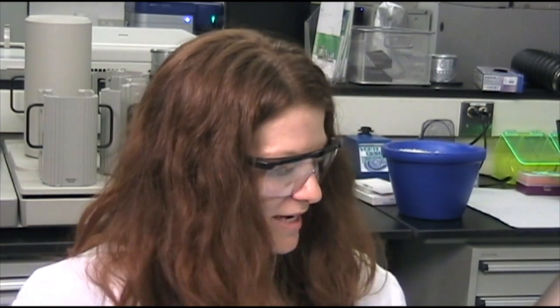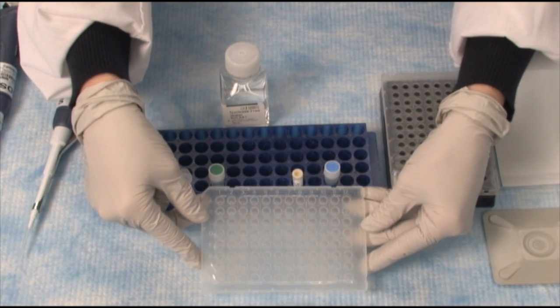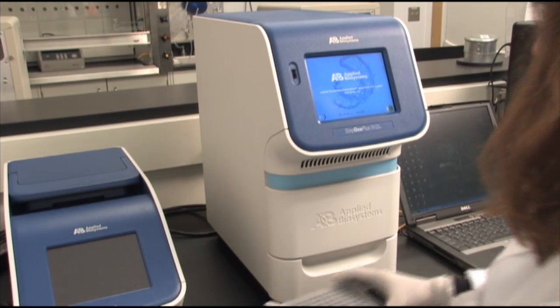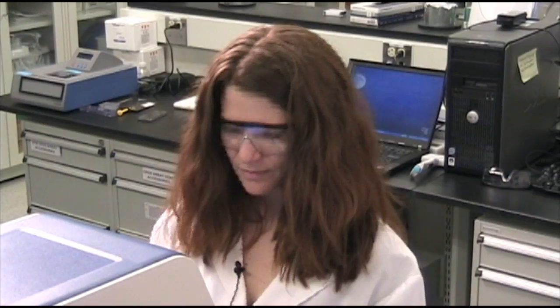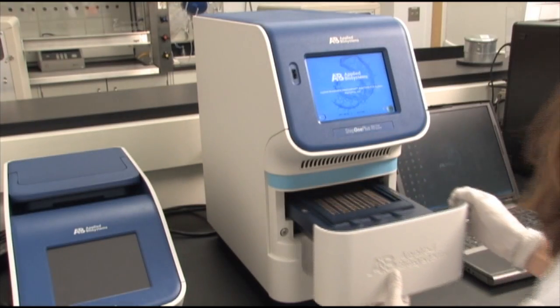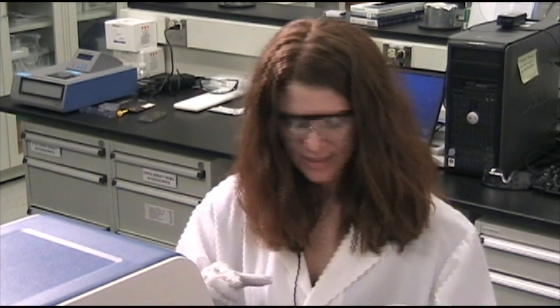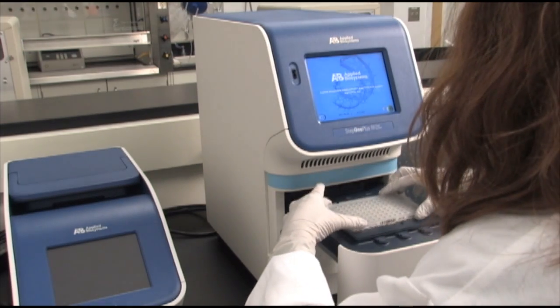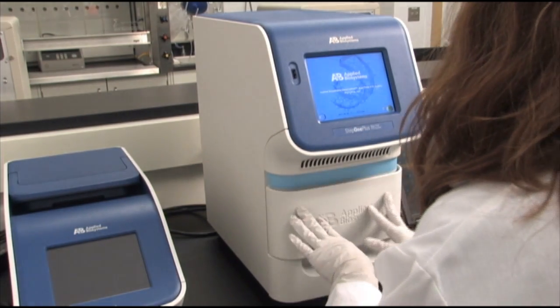You then seal the plate. This is the final product, which we then run on the instrument — in this case, the StepOne+. Now I'm walking over to the StepOne+. I'm going to load my plate in the instrument, simply by pulling open the door and setting the plate. The A goes up in the top, as usual, and closing the door.